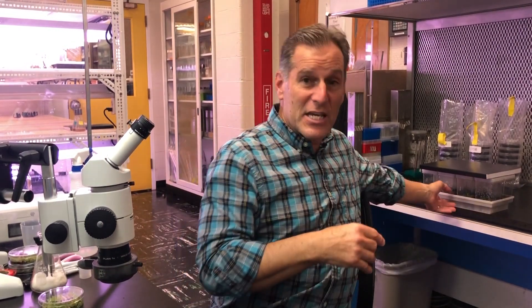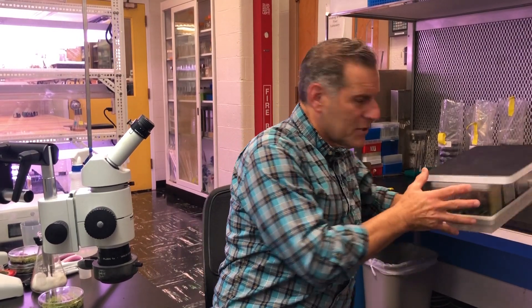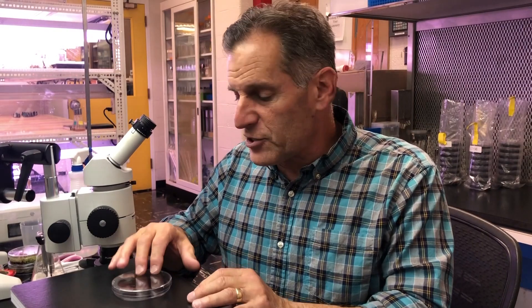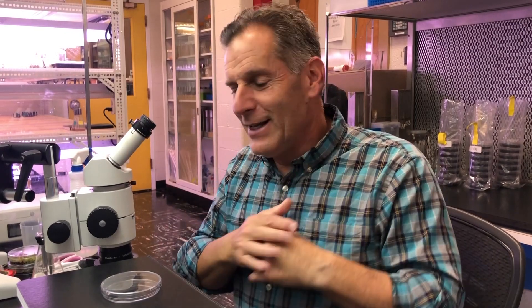The other thing I want to talk about is, because of the airflow in this cabinet and this hood, how you have to work with cultures and Petri dishes. So if this is the hood surface and this is a sterile Petri dish, the inside of the Petri dish is sterile, and the air is blowing out at you. The flame — because the air is blown out at me — is a good indicator that the hood is working and in good operation.